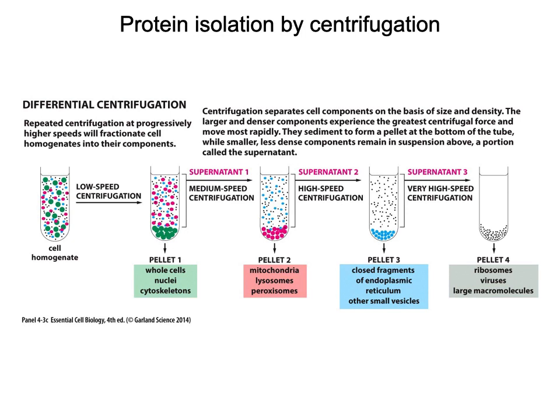If we take that supernatant and move it into an even higher speed centrifugation, what we would end up in our pellet are very small components like ribosomes, right? So ribosomes are protein, RNA based. There are subunits that are coming together. We also have viruses, and if we think about viruses, for students who've taken microbiology, but also real-world application, they can range in sizes, right? And so they're relatively small, much smaller than most cells, and so if we're only centrifuging at low speeds, they're going to be in that supernatant.